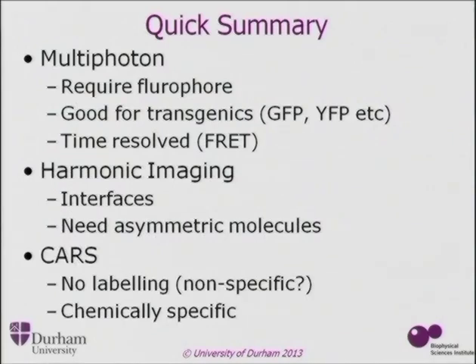You don't need any labeling, but it's not going to be specific. It is specific for a particular chemical, but not how that chemical or where that chemical has been produced. Any chemical that has that vibrational mode will be excited. So it's chemically specific, but not where that chemical may have come from.